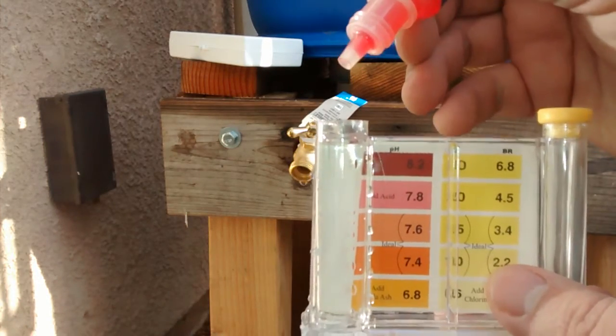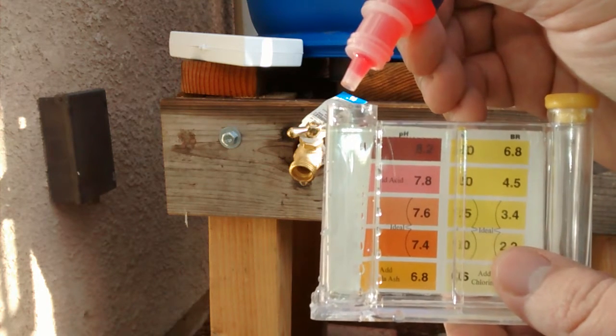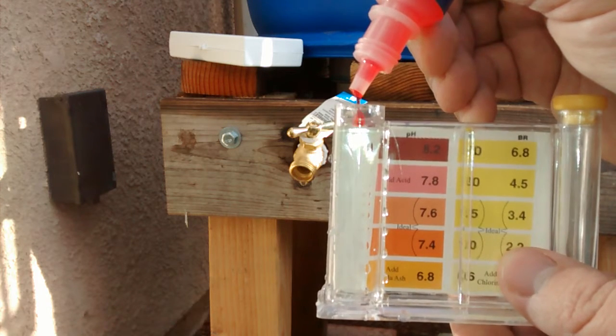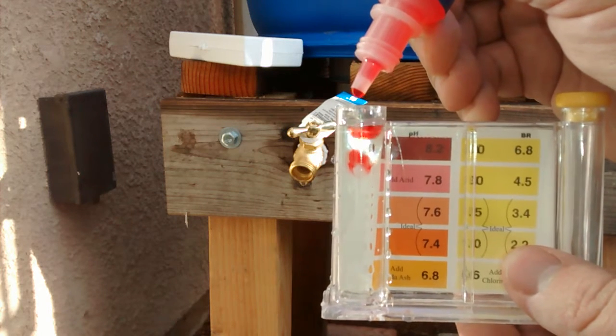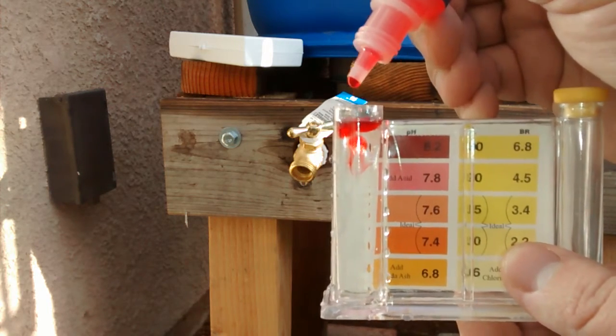So here we go. Let's do this correctly because I only have about ten drops left. One, two, three, four, five.